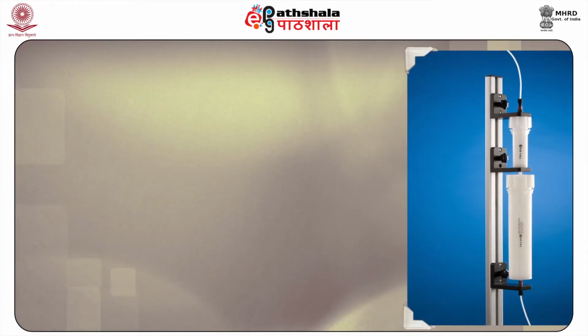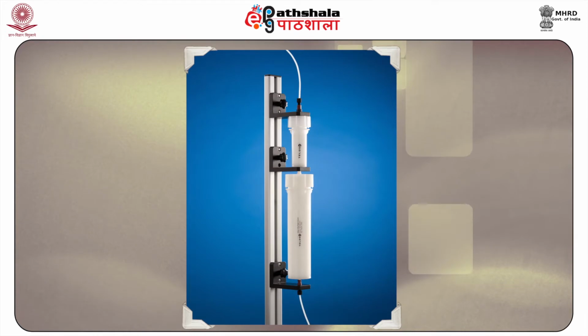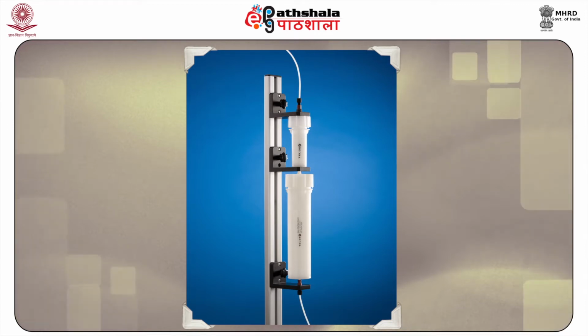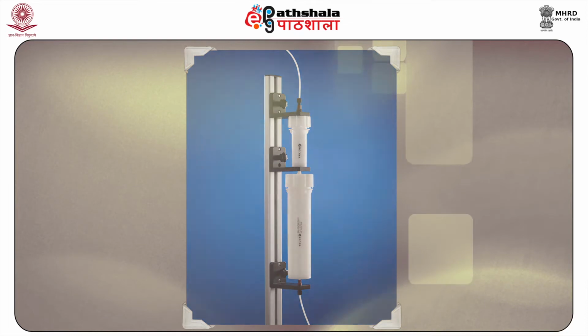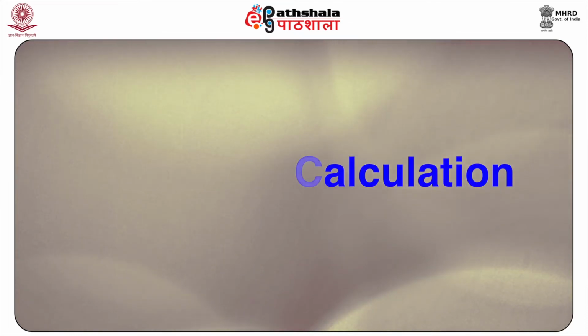In flash column chromatography, the grain size of the adsorbent material that makes up the stationary phase is finer in comparison to gravity column chromatography. Now, about the resolution calculation.